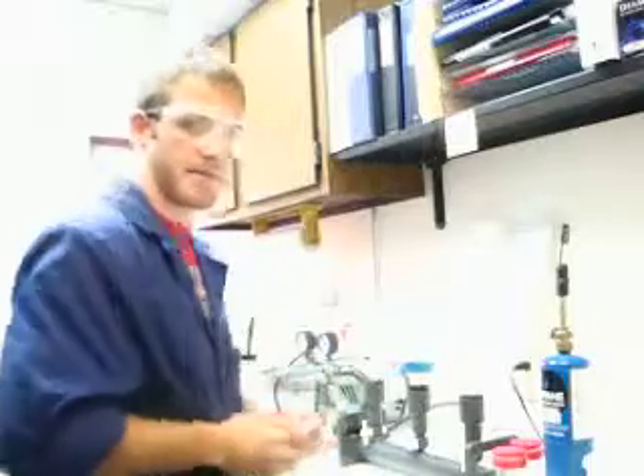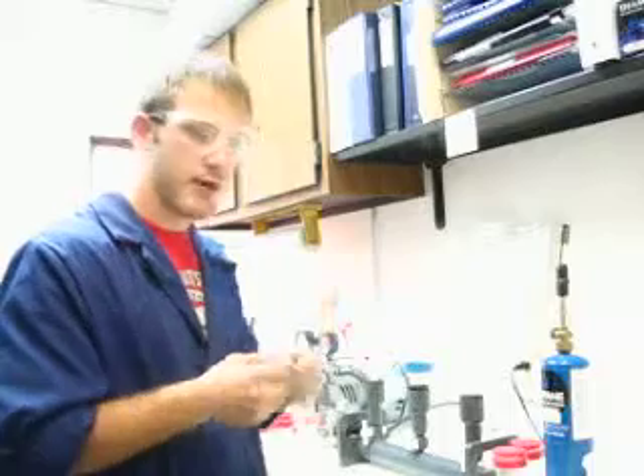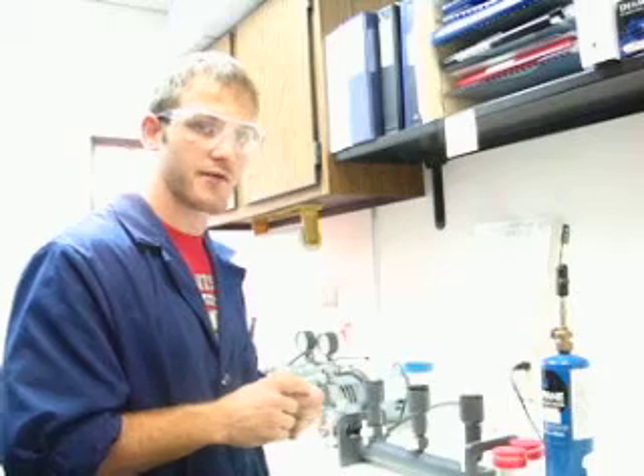The last step: I will place this in an incubator upside down for 24 hours at a temperature of approximately 45 degrees.